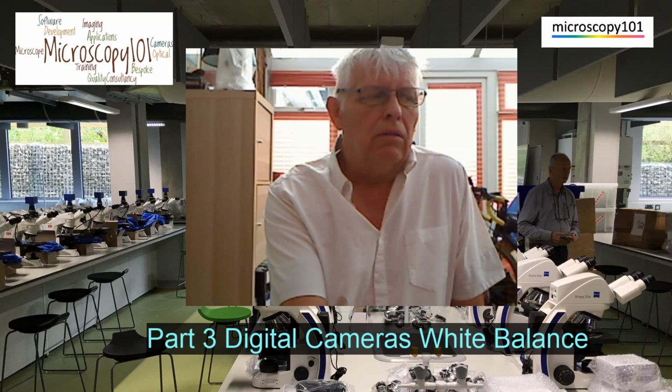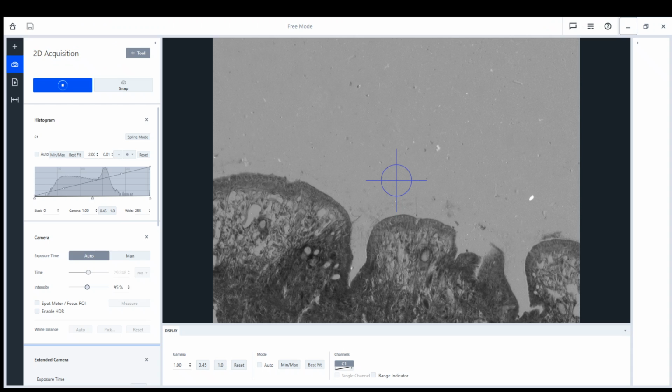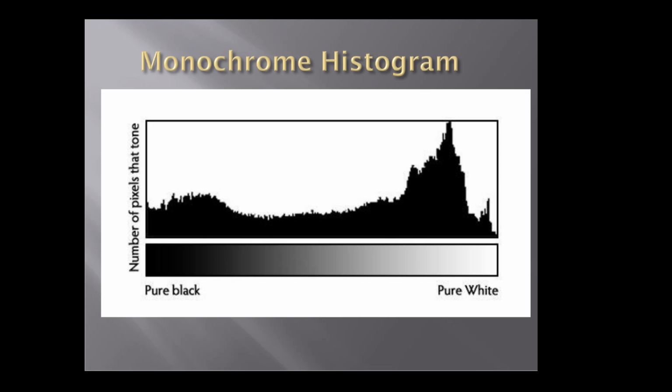Now, when we look at the image, we would like the image to be exposed correctly, and this is going to be helped by understanding the histogram. So the histogram is a snapshot of the image.